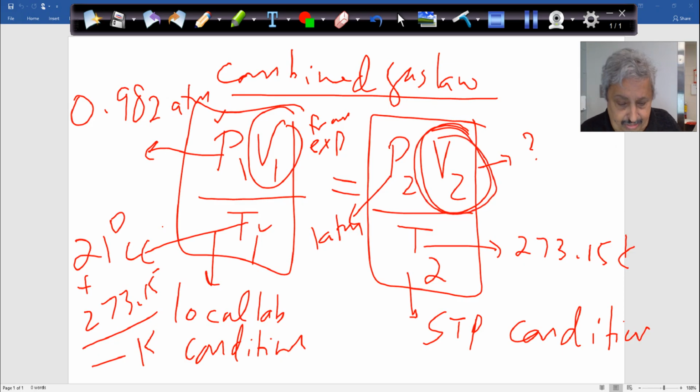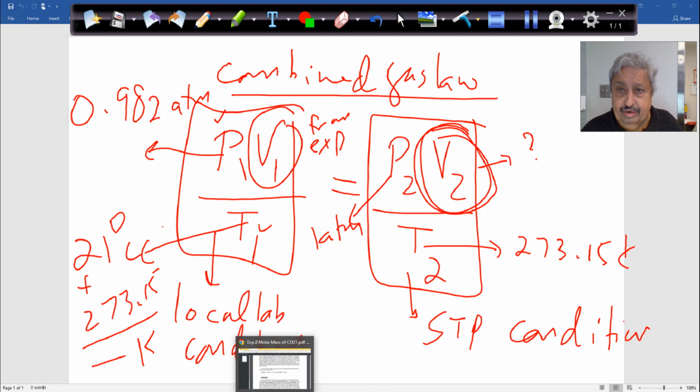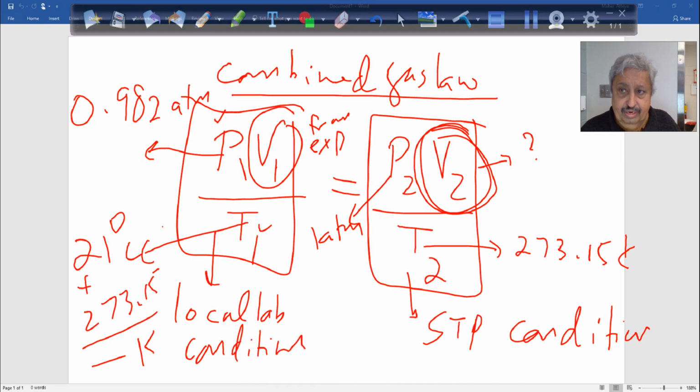Now let me go and look at the, I'll take this one out. Everybody has it? Everybody has this? Who's that? Okay, that's fine. That's fine. Go ahead. Whatever you find.